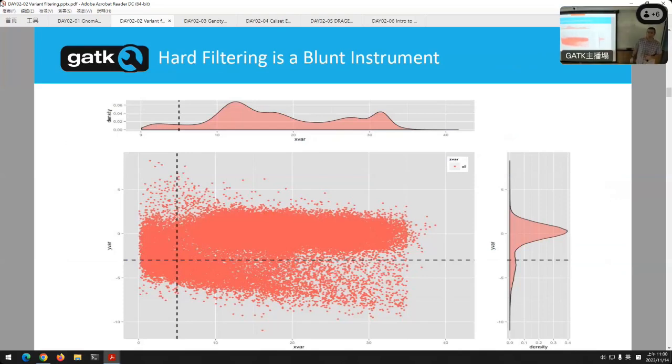And then in the olden days, we chose hard cutoffs. We'd say anything to the left of this line is bad, and to the right of this line is good. Now, it worked fine for 99% of the variants, okay? But it's a blunt edge instrument, that blunt edge sword. So let's say you have a good site that's just barely bad. Everything's a distribution in terms of a bell curve, and it's just on the edge, just barely over for one of the dimensions. But the other one is perfect. In 10 dimensions, it's amazing, but in 1 dimension, it's just slightly bad. We've just lost that site because it failed the filter.